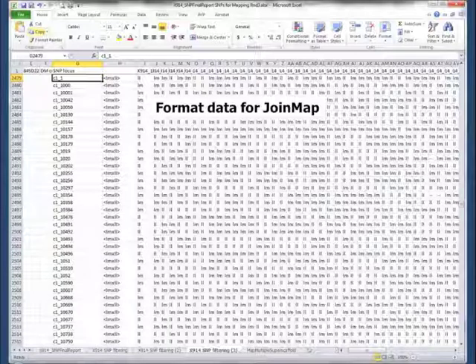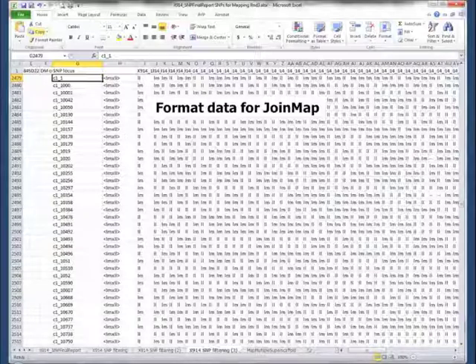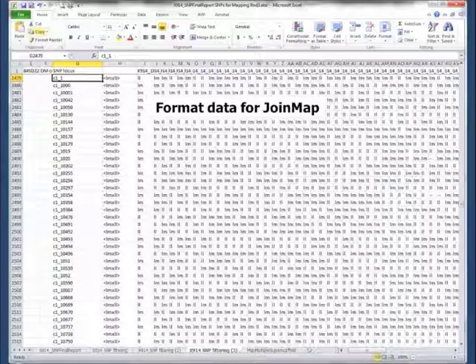You have to put the type of segregation you're expecting. In this case it's LM by LL. And then you have to convert from the SNP calls of A's and B's to LL versus LM. So just some data manipulation that goes on.